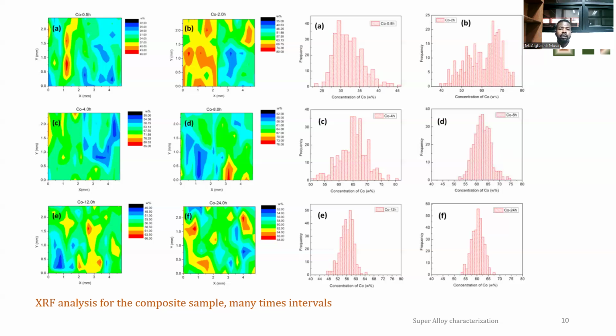So generally it's concentrating around 60% of a cover in the surface, for more than 50%. So it's considered a very good result for the mechanical mixing. So from here, we could give a remark. So mechanical mixing, it started well.